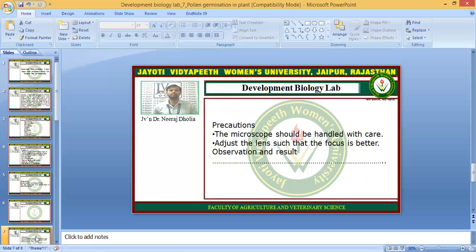As precautions: the microscope should be handled with care and the lenses should be adjusted so that the focus is optimal for better observation and results. You can also include a diagram or photograph captured through the microscope in your results.